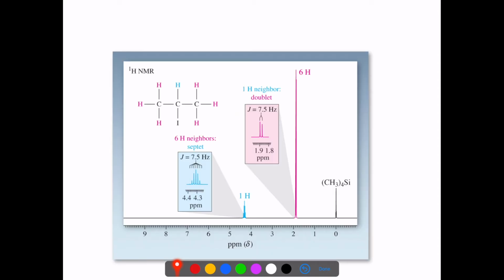And just that last one that we saw, bringing it together, we have the 2 types, the 3 red here, 3 red there, which is a total of 6, and then this 1 blue one. These 6 hydrogens absorb a little bit downfield, even though they're CH3, because of this iodine, this electronegative atom pulls them downfield, so it's absorbing here between 1.8 and 1.9. There are 6 of those represented by this peak, so that's integration. So this is 1 signal, integration of 6, chemical shift down here because of the electronegative atom.